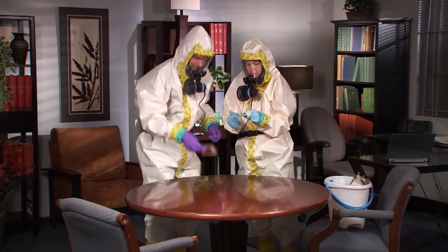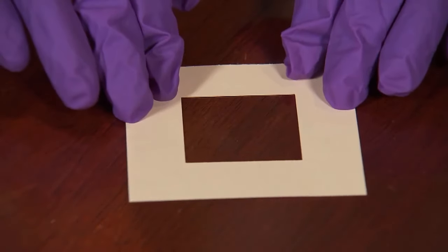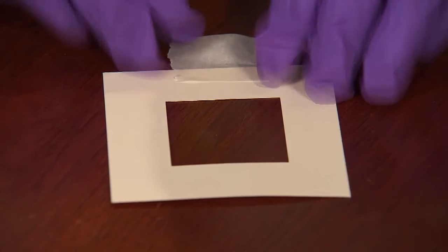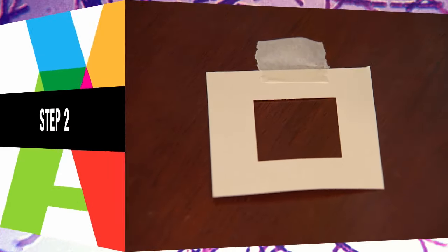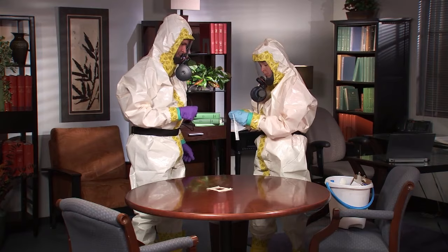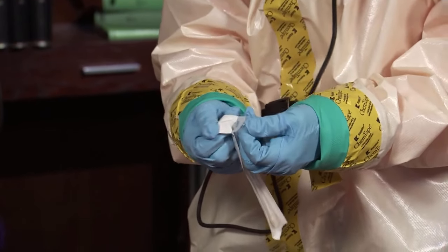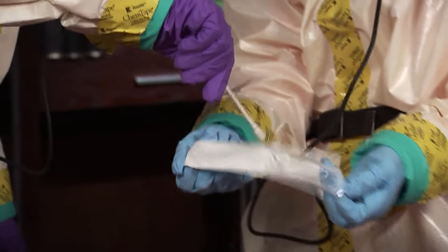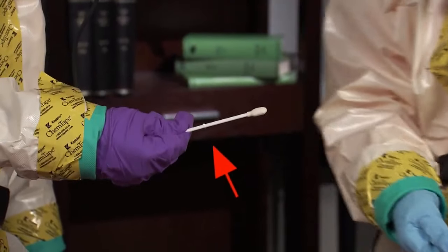The sampler places a 2 inch by 2 inch template over the area to be sampled, or the sampler can measure out an area no larger than 4 square inches. The assistant opens the swab package without touching the swab or its handle. The sampler removes the swab by grasping only the swab handle above the thumb stop.